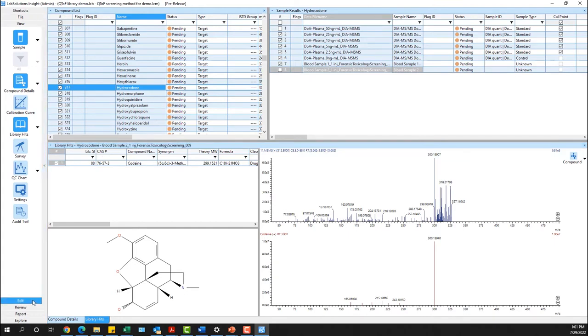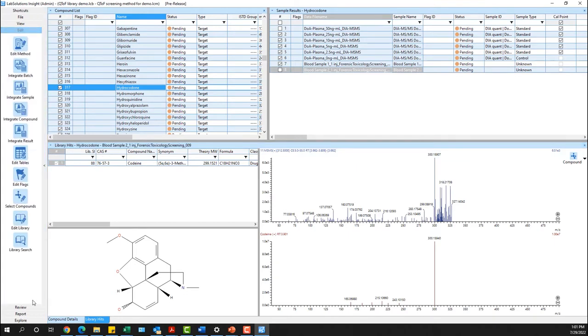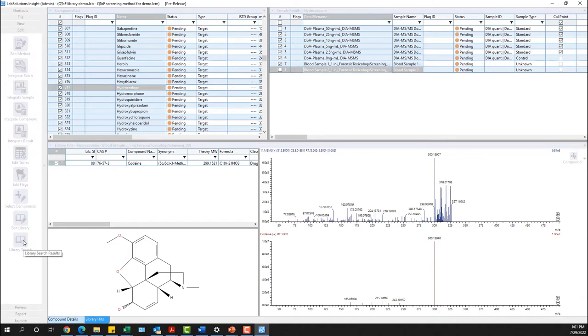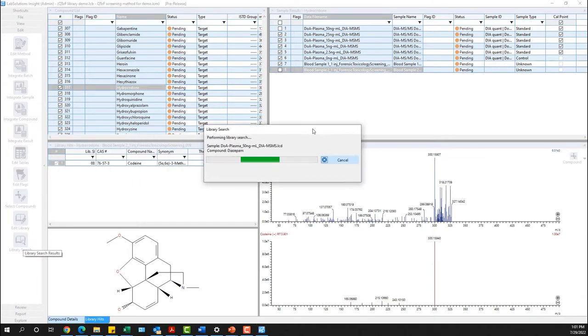The last workflow, and most common, utilizes the library search icon and will search all compounds in all samples one time.